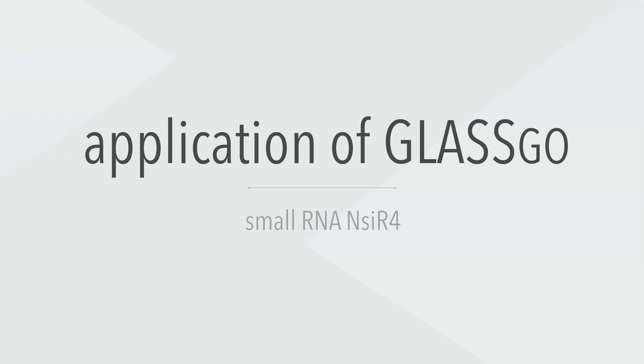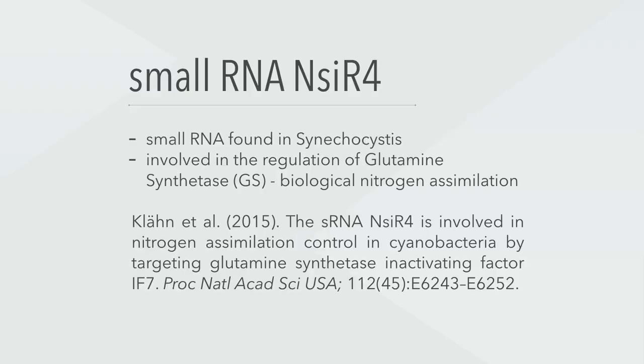In this video, we will showcase GLASSgo in detecting homologs of the small RNA NSIR4. NSIR4 is a cyanobacterial small RNA that has been detected in Synechocystis by Klähn and co-workers. It is involved in regulation of glutamine synthetase, which is a key enzyme in the biological nitrogen assimilation.